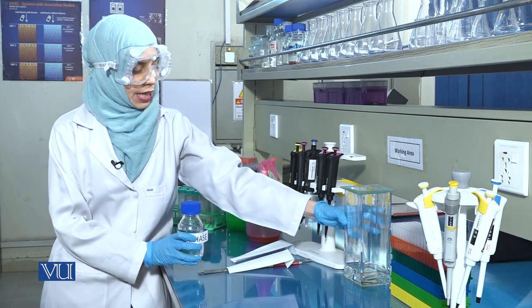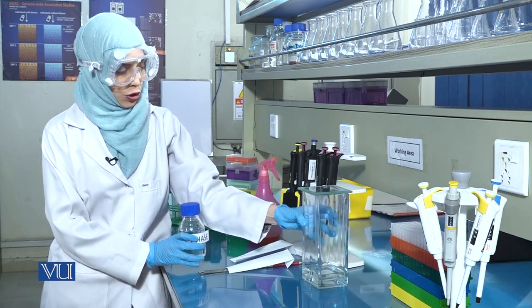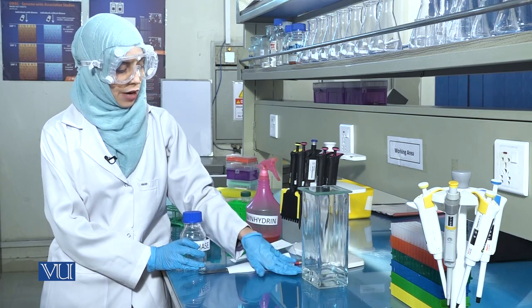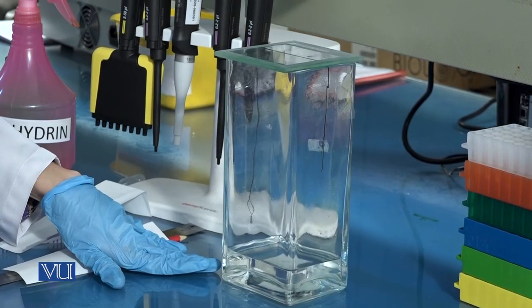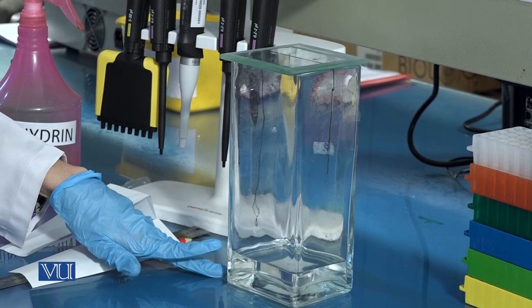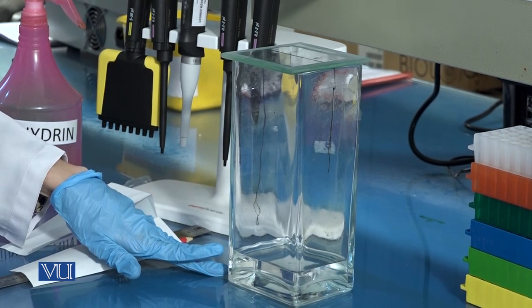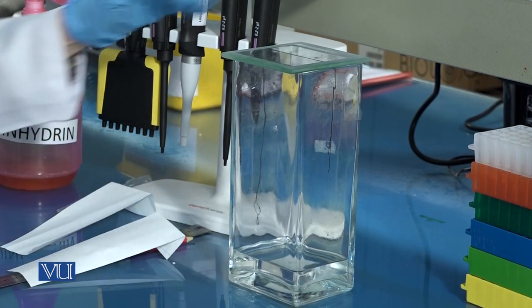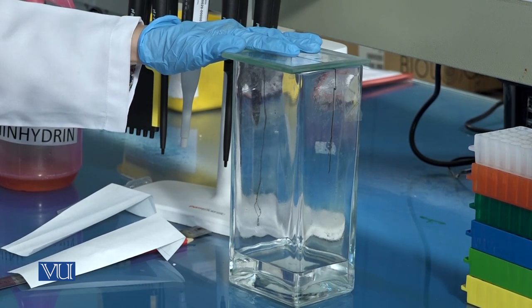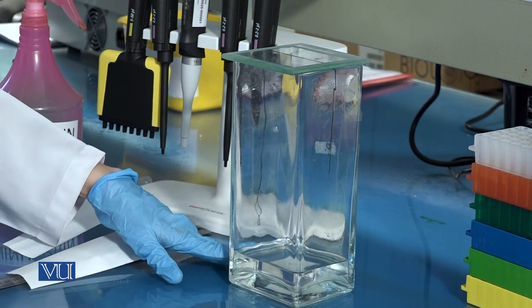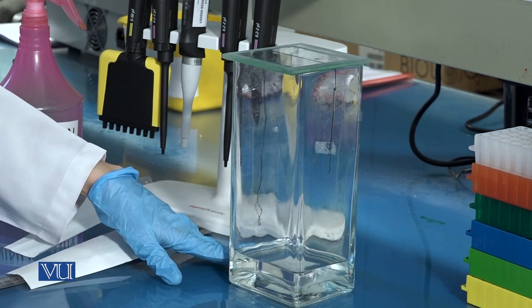Take a chromatography tank and add the solvent to it, ensuring that it covers the base of the tank, forming a layer half to one inch in thickness. Cover the tank and allow the atmosphere to get saturated with vapors of the organic solvent or mobile phase.